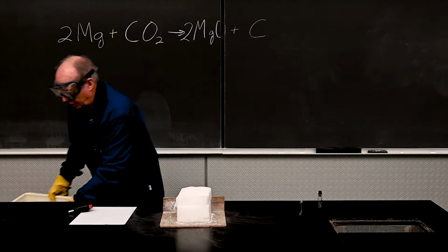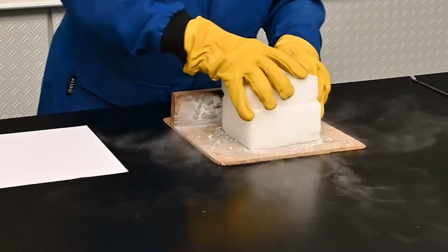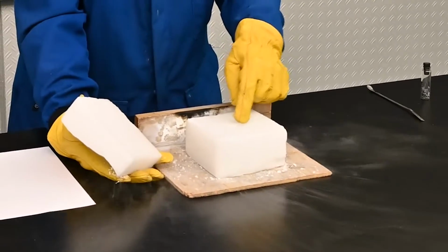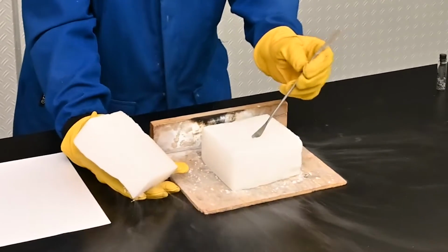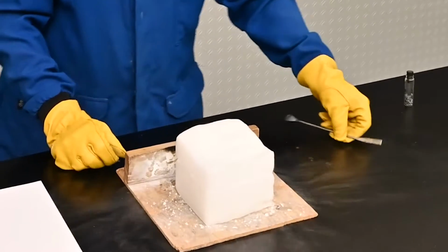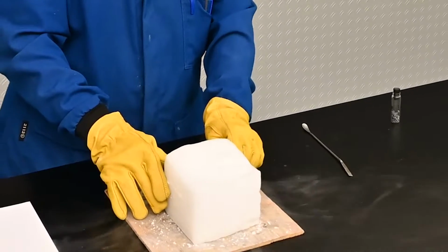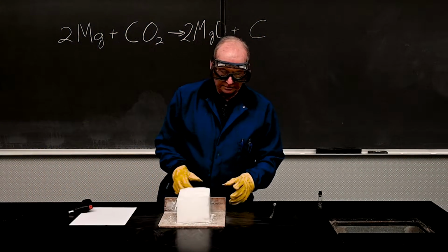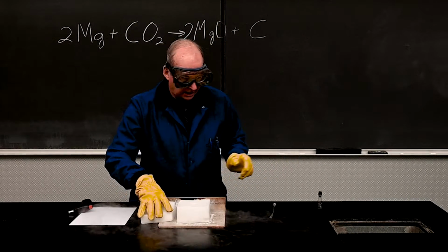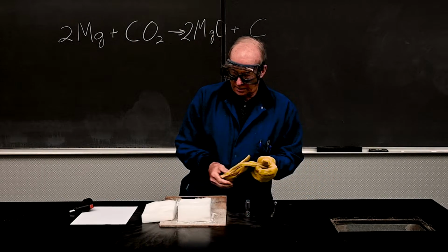So you can see we've got a cube there, and what we've done is purposely cut the cube in half, or roughly in half, and then inside here is a divot in which we're going to put the magnesium, and then we're going to encase it so that the magnesium is pretty well isolated from the oxygen in the atmosphere here. And yet you will see that it continues to burn and doesn't go out because of lack of oxygen, but it goes out because we completely consume the magnesium.